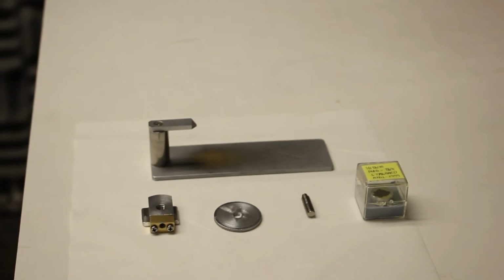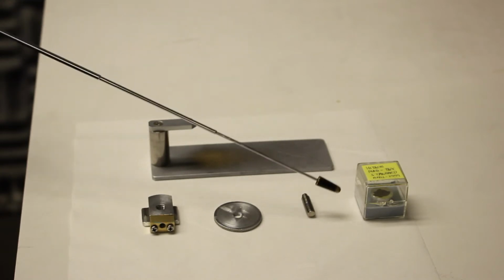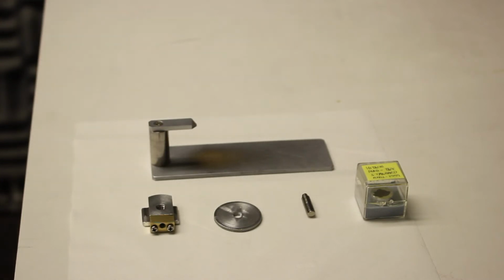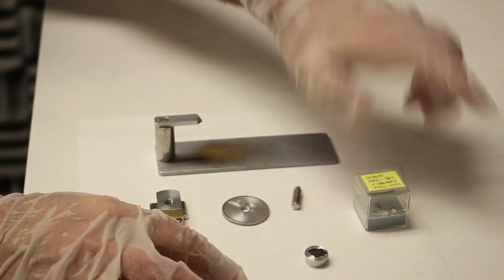Okay, assembling the sample holder. You'll need the dovetail base assembly, the locking washer, a threaded post, and the height measuring jig. Today we're going to use the Hitachi high-res standard as the sample. So the sample is already mounted.